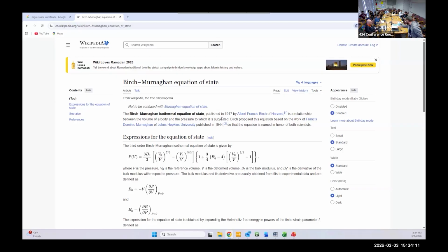So this equation here takes in the bulk modulus and its derivative at ambient conditions. And then you use the thermal expansion to get the temperature, and you take that value at ambient conditions. So what you're saying is, let's say this is pressure, this is temperature. Then you have a certain volume, based on the D spacing that you have.